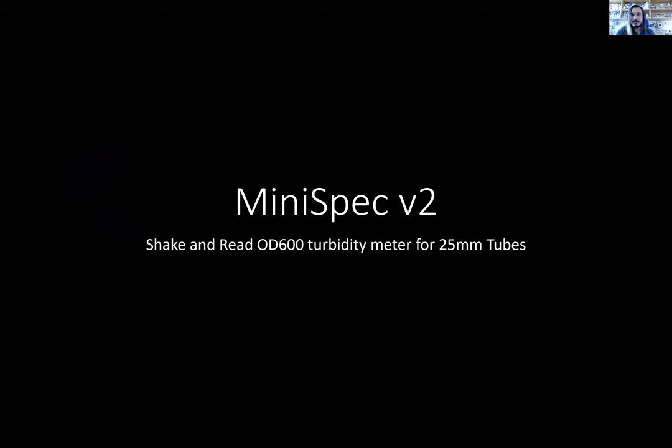Now, I'm working on ideas for that, for like autoclavable sensors, a whole suite of autoclavable sensors that you can pop in, which is cool. But in the meantime, I still needed to measure growth curves because I had a project where I was studying media. Like actually behind me over there is a bunch of media bottles of varying concentrations of different ingredients, and I wanted to see how E. coli respond in that media.